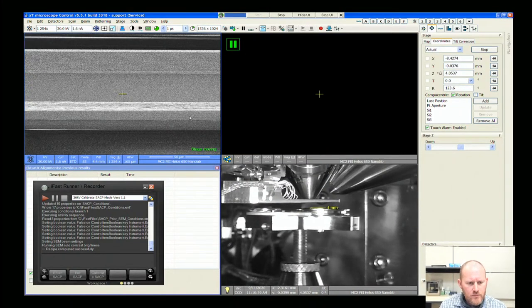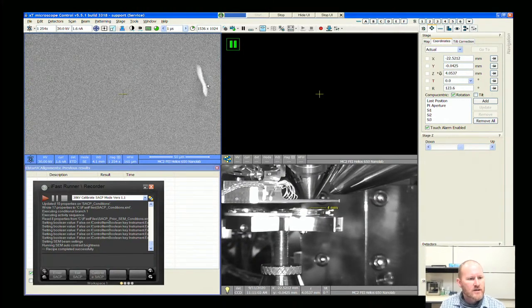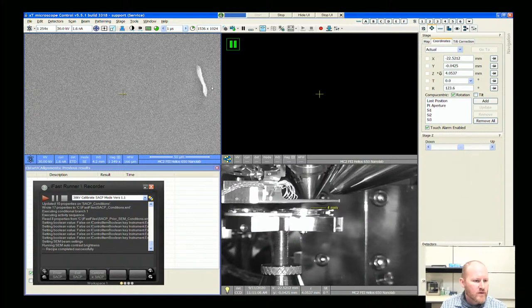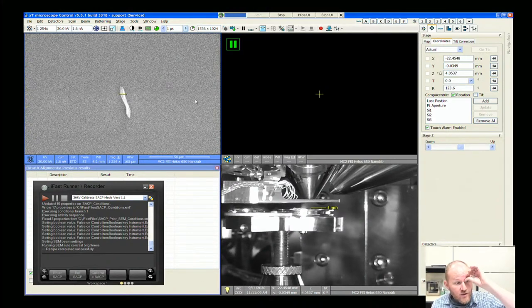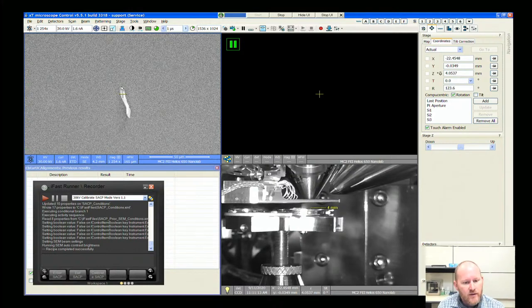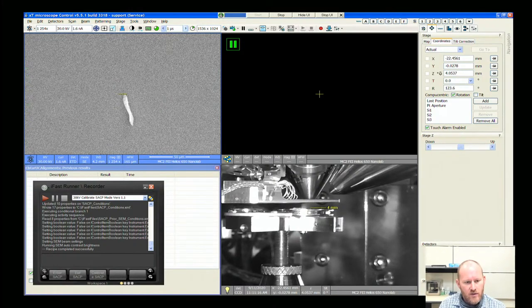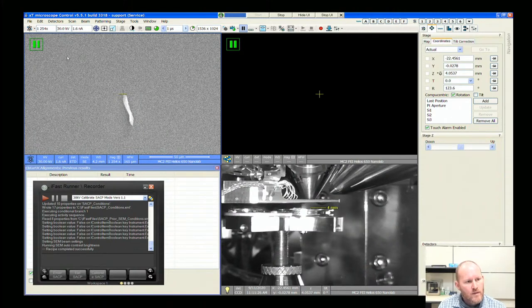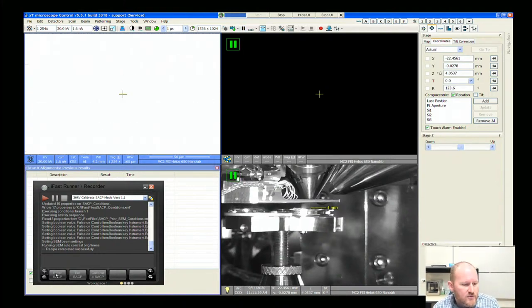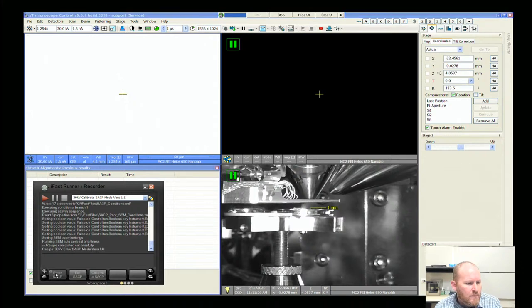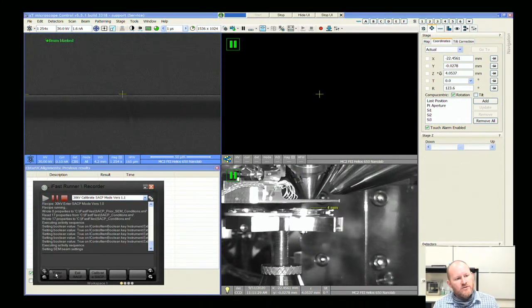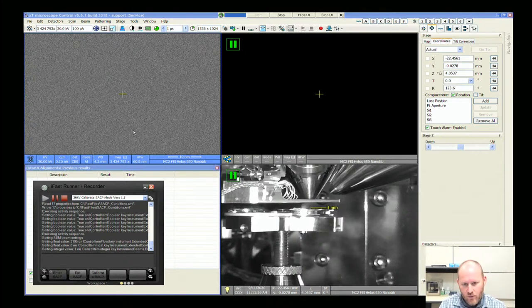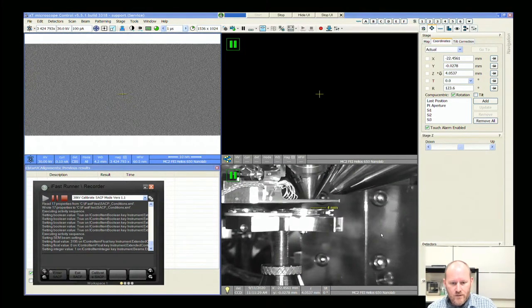I'm going to move back to the silicon wafer. We have a [100], [110], and [111] oriented wafer in here. Our CBS detector is inserted so I'm going to activate that. I'm going to go ahead and just click our script — this was written by Alan Hunter on our staff — and we'll try to enter SACP mode. Honestly I haven't looked at this for a while.